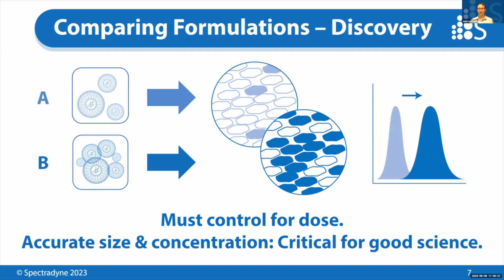One important point here is that there are a lot of tools for evaluating the outcome, right? These are usually in cells or animal phenotypes or lifespan measurements or something. And there are a lot of good tools like flow cytometry for evaluating the fluorescence activation of cells, for example. But there are not a lot of good tools for normalizing and quantifying the products that affect that change.